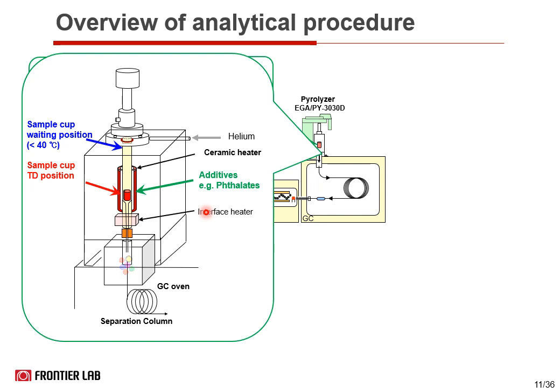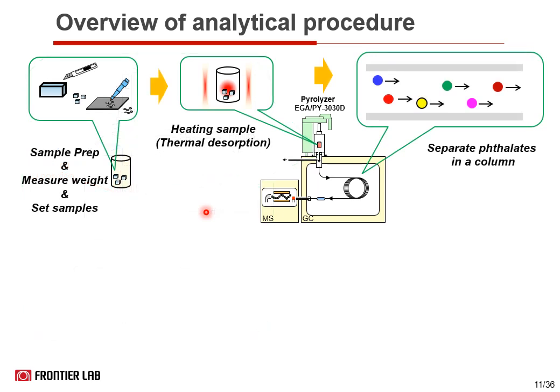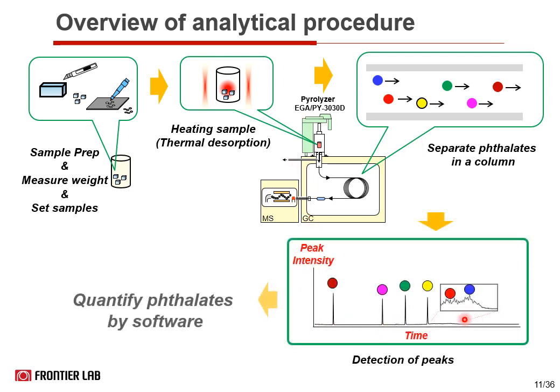Then these phthalates are separated in the separation column and detected as peaks. Then we quantify them by software.